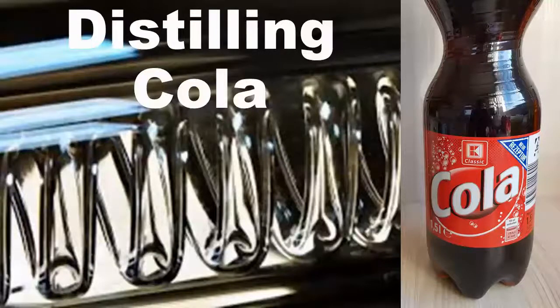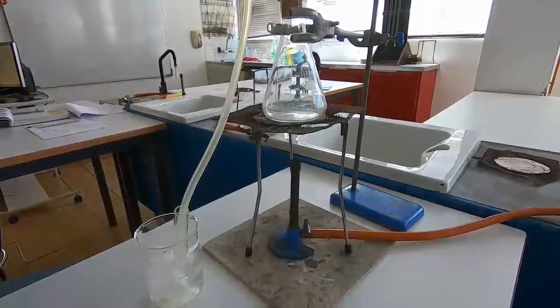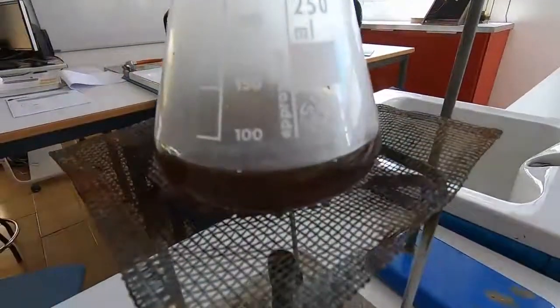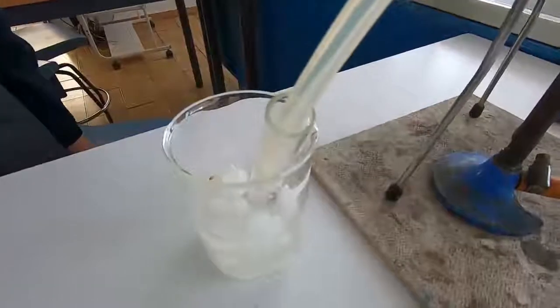In this experiment we're going to investigate distilling a sample of cola. Here's the apparatus all set up and we're going to put the cola into the conical flask. There's the cola sample in the conical flask and we've got a collecting tube immersed in iced water.